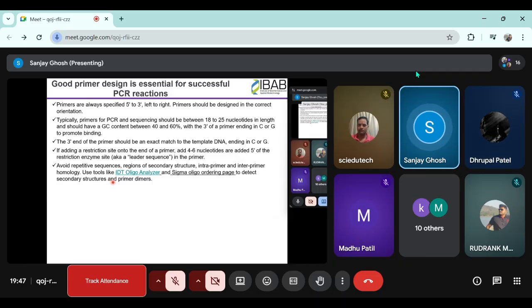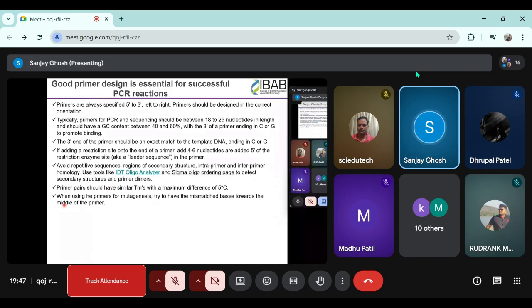You can manually check. These are the design principles that I am mentioning. If there are two primers that we have to design for every PCR, the primer pair, the TM or the melting temperature, which again a tool will tell you, the difference between the forward and reverse primer typically should not be more than 5. Less the better. More the problem. PCR may fail or it will almost fail, right?